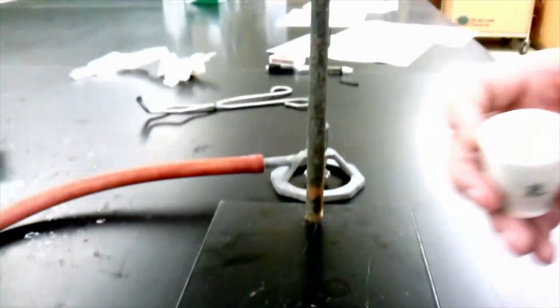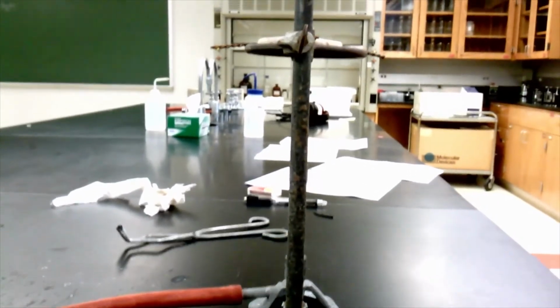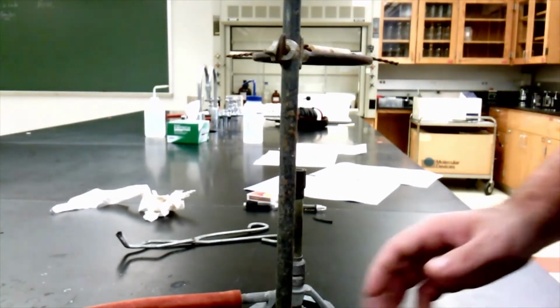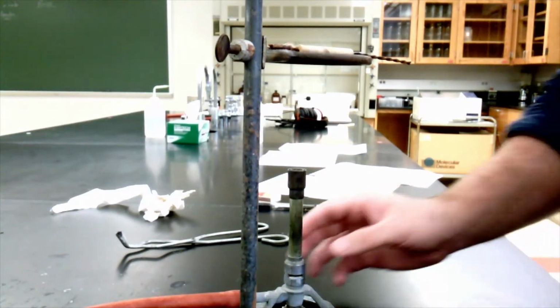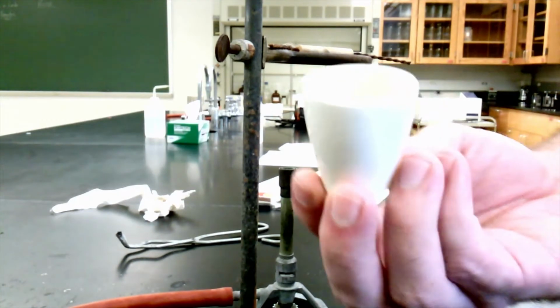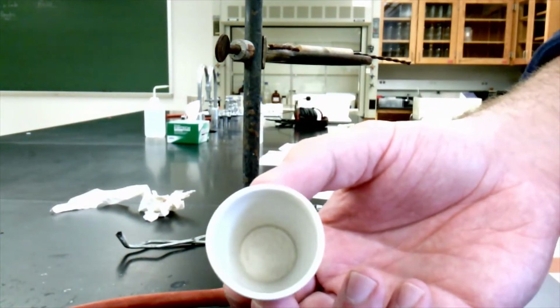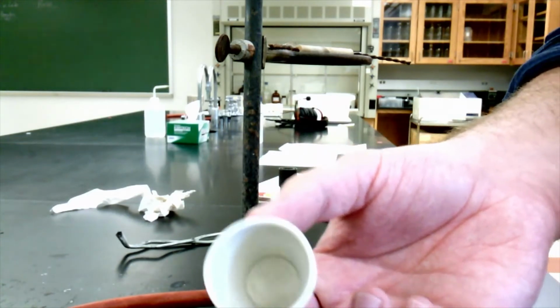Okay, it says in the procedure to give it a little tap, make sure we don't hear any weird noises that might lead us to believe that it's cracked. Sounds pretty solid to me. Okay, the next thing I need to do is get my Bunsen burner into the frame. I need to get my Bunsen burner ready to heat this, because what I'm going to do eventually is put my magnesium metal in here. Okay, we're on procedure B, we're making magnesium oxide.